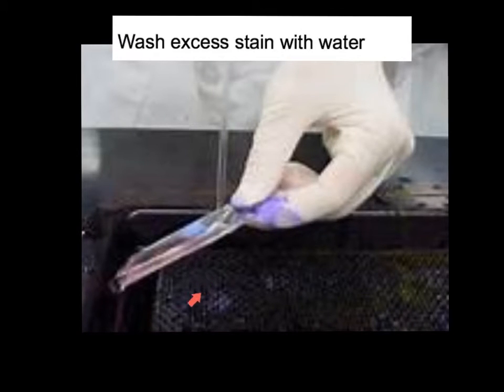And you'll notice that our steps require stain, rinse, blot, stain, rinse, blot. We see this a lot. But we have our smear right here, and again we are going to rinse with water, rinsing above the smear, holding this at an angle so the excess stain will drain off. We will then gently blot dry our slide with a paper towel so as not to remove the bacteria culture.